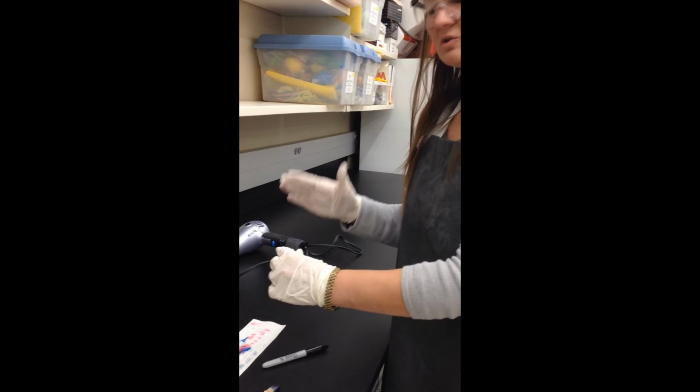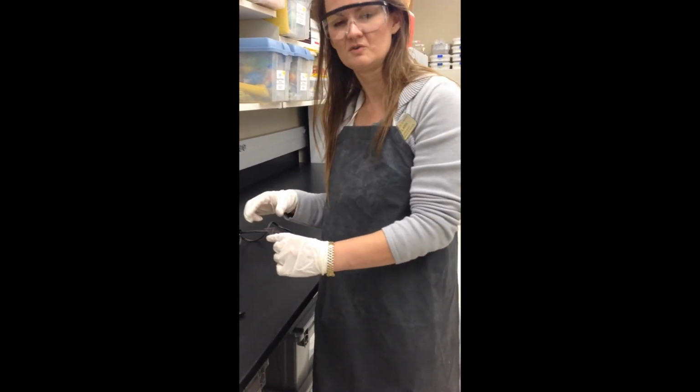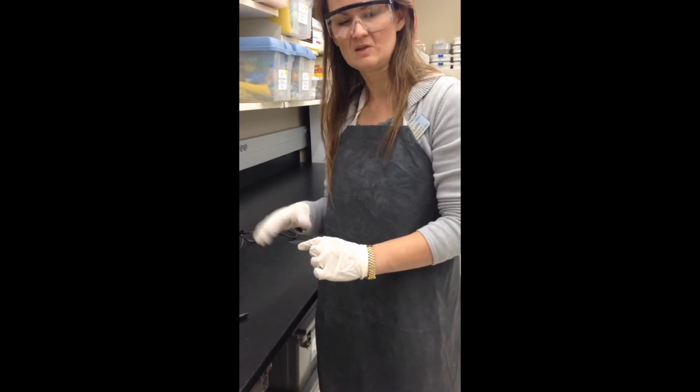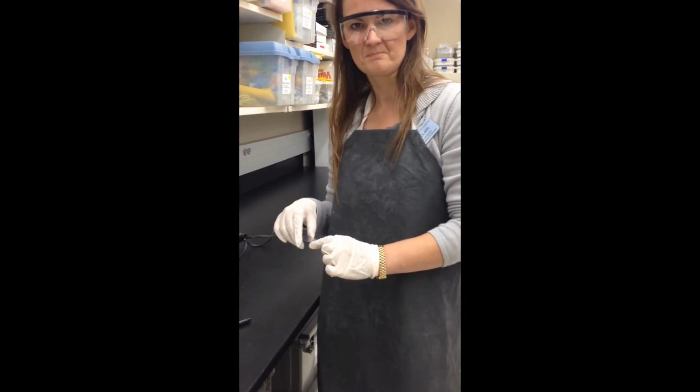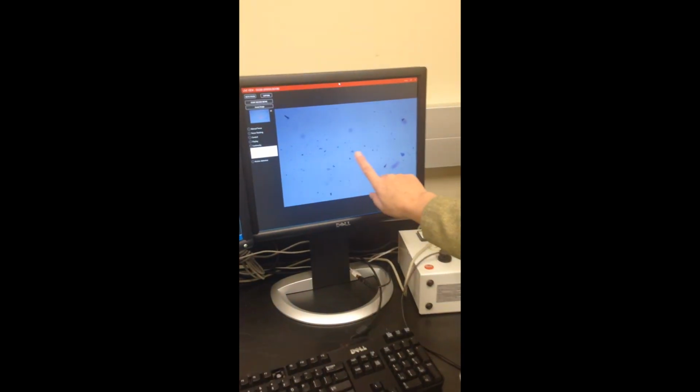What you'll do is you'll start on low power, go up to 10, then go up to 40, which is a total of 400, to view the cells that you've burst open. And then you'll count the chromosomes at that time. After you split your chromosomes, you'll bring them into view on your microscope. This is a television image of what your cells will look like from the beginning.